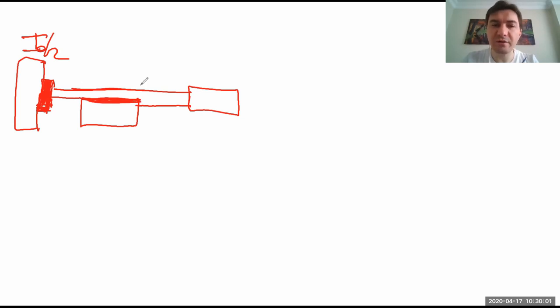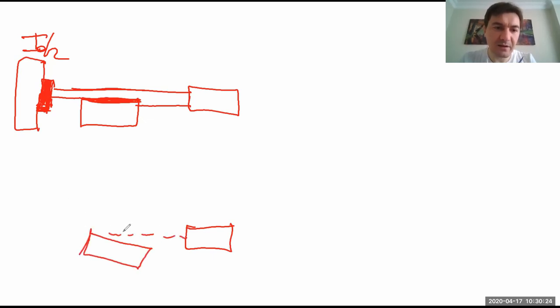In order to correct this one, we have to go to a little bit higher angles. So we are doing like this. X-ray source is staying again like this. And now the sample is staying like this. And now X-ray beam comes with some certain theta angle and is reflected with the same theta, or 2 theta angle. Okay, this is the detector angle 2 theta.